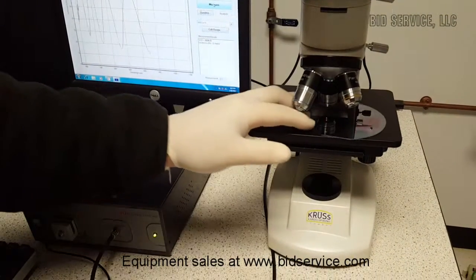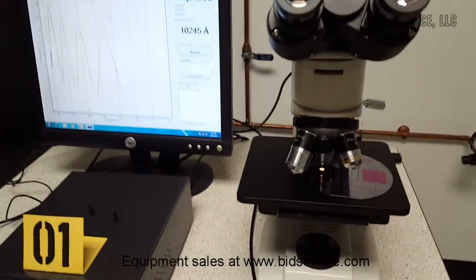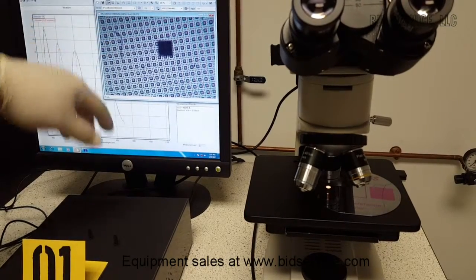I'll just show you focus. I'm going to go over here on the computer screen and bring up the window. You can see that I have it focused in right here.